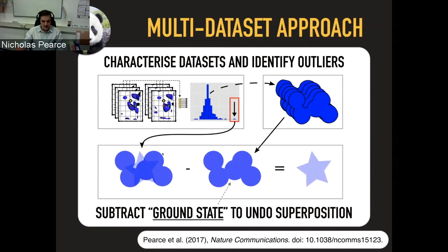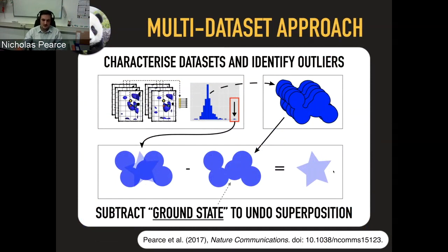Even after identifying partial-occupancy ligands, we still can't model them because they're a superposition of two or more states. But because we know the background, if we can calculate the approximate occupancy of our ligand, we can subtract off a weighted fraction of the background to reveal only the density for the ligand — effectively removing all the unbound proteins from the crystal and simulating what would happen if the ligand were bound at full occupancy.